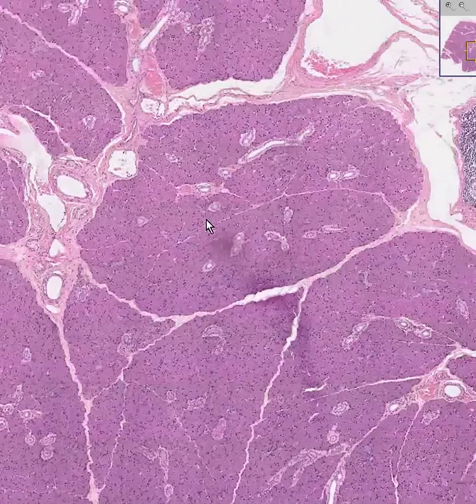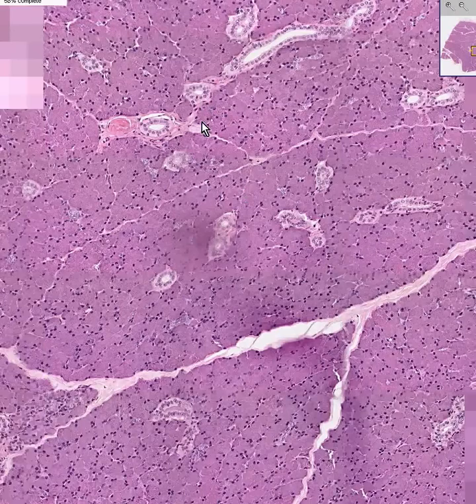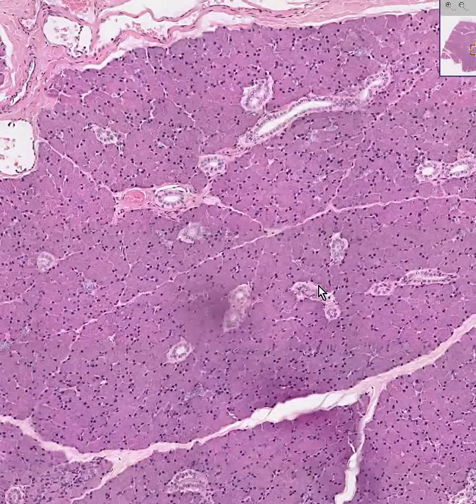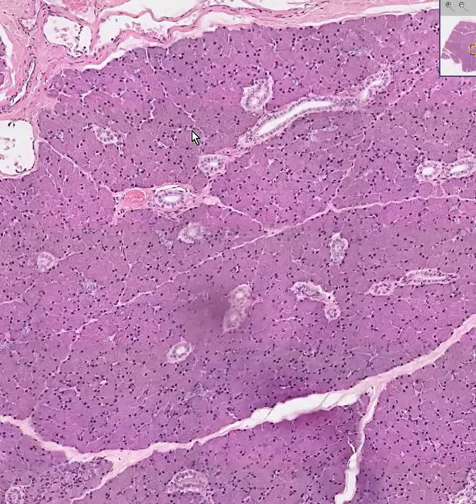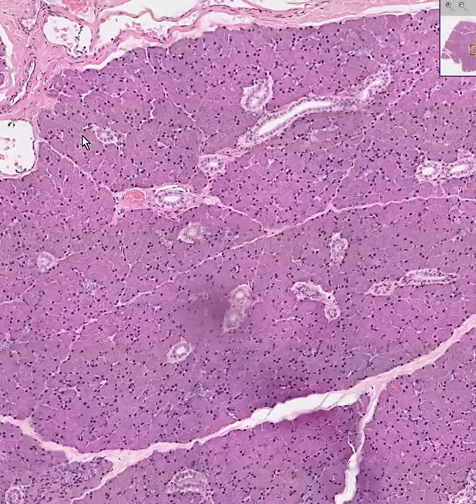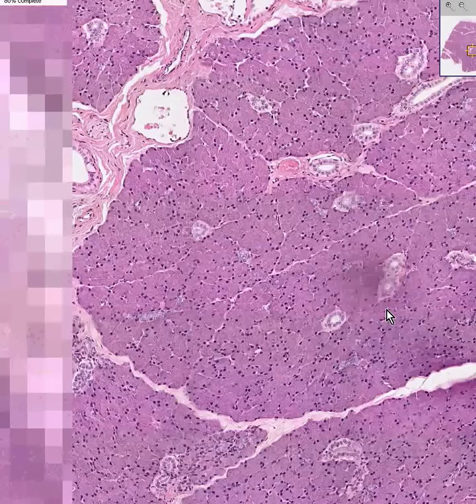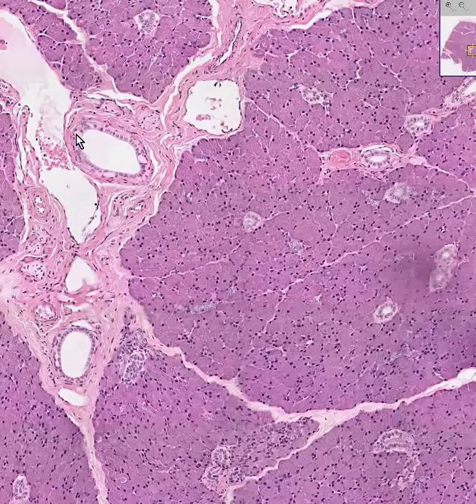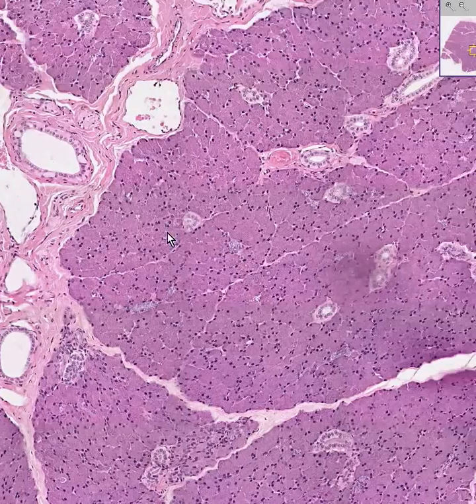In this particular exocrine gland, almost all of the secretory units are serous rather than mucous, because they don't stain like mucus in any way. In addition, you can see some interlobular ducts between the lobules, and — to clarify — these here are intralobular, while this one is interlobular or between lobules.